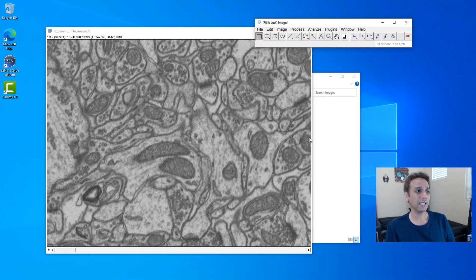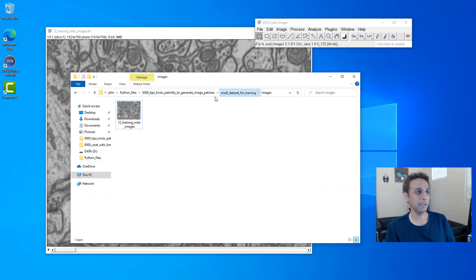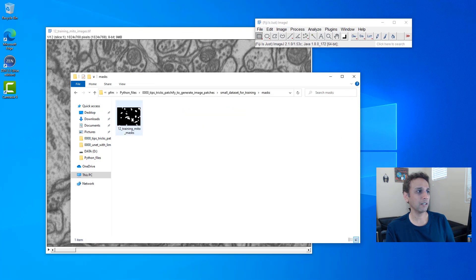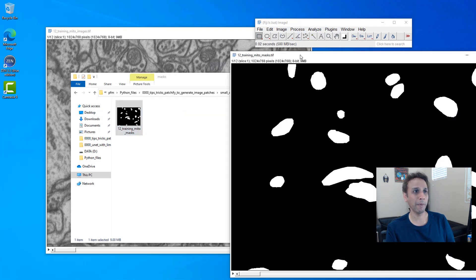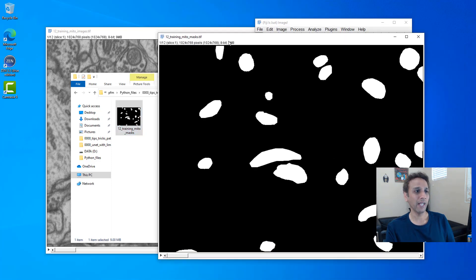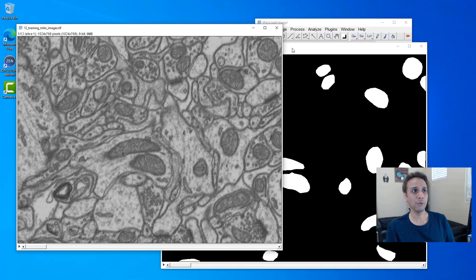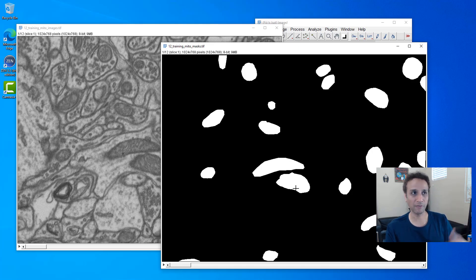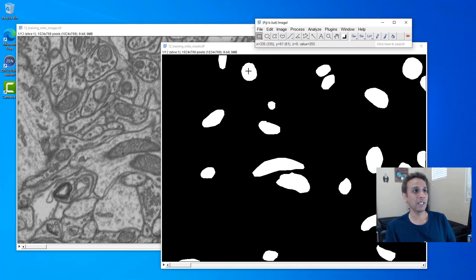Most of the time, rather than images, I interact with masks here. I can go ahead and open my mask. You can synchronize these two images — as you move one image, the other one moves, making it easy to keep track of things. Looking at the mask, you can see the value is 255 here and zero elsewhere.